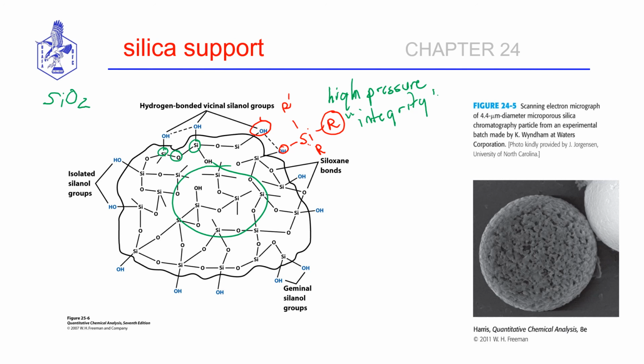One thing about the silica surface, through 50 years of research, scientists have tried to optimize the reactions so that we react all of the silanol sites on the surface and get rid of them. However, that is impossible to do. So for a number of reasons, we are going to have some unreacted silanol sites on the surface.